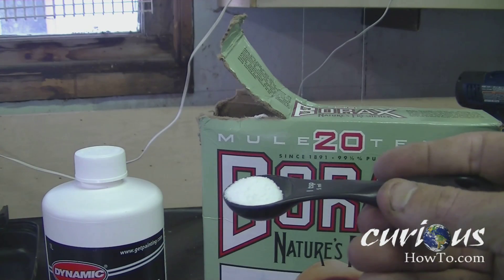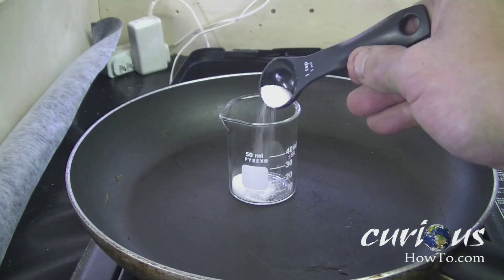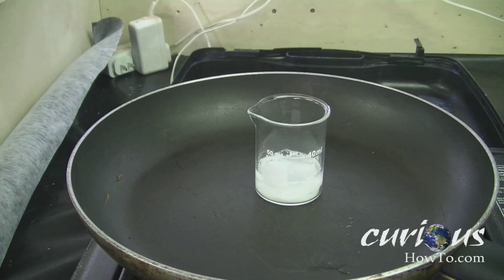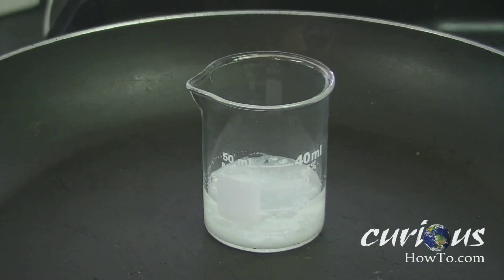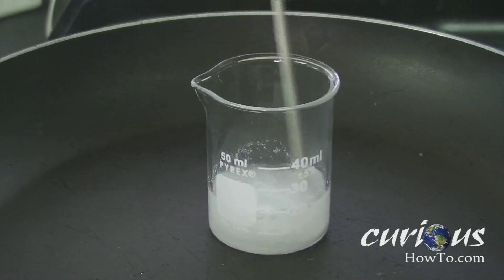The first thing you're going to want to do is put about half a teaspoon of borax into your glass beaker, and you're going to want to add about 15 to 20 milliliters of muriatic acid into your beaker. We've added about 20 milliliters of muriatic acid to our beaker.